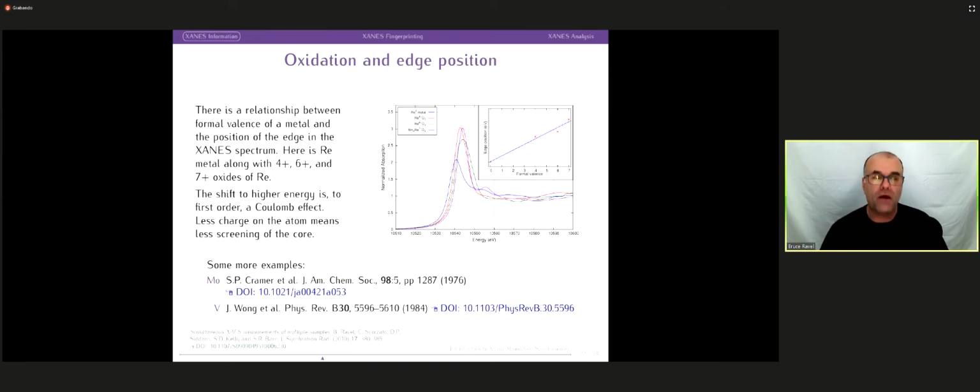That is a good thing in the sense that you can get this valence information for oxygen ligands and all other kinds of ligands, but it does add an element of complexity to trying to understand a real system. If you were looking, for example, at a sulfidation reaction, so you were seeing an oxide be transformed into a sulfide, say under the flow of hydrogen sulfide, or in reverse under the flow of oxygen, it could be a little bit complicated to interpret the spectra because you could have multiple valence states of oxygen and multiple valence states of sulfide in the same system. So the short answer is yes. The complicated answer is it's complicated, and you might have to do some real thought in the interpretation of that kind of experiment.